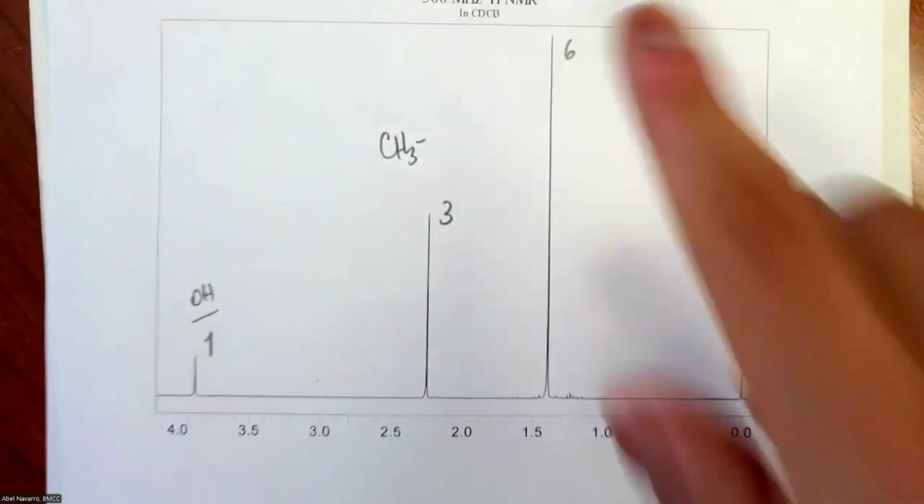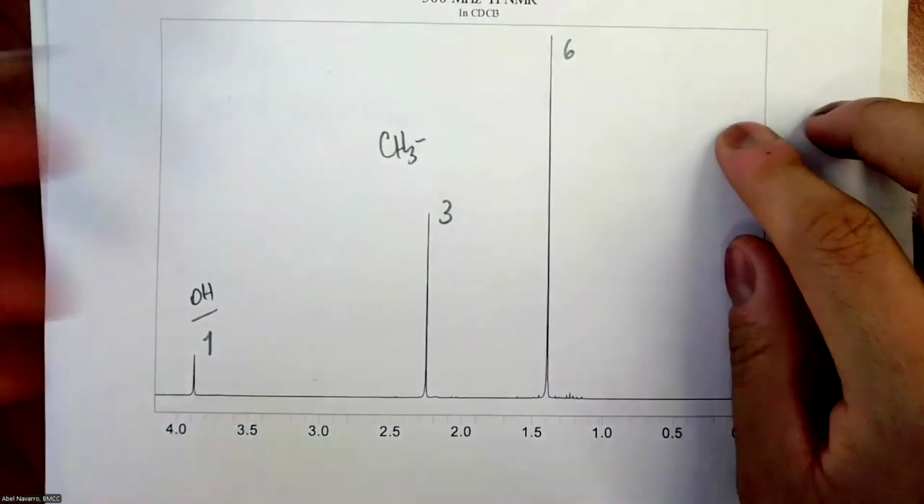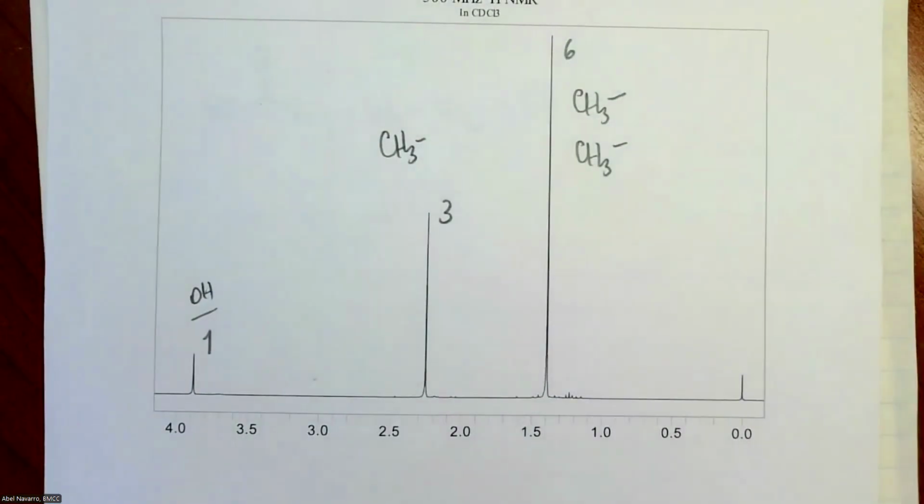And 6. What could be 6? Okay, so of course it's not a CH6. So what could that be? Okay, that one should be 2 CH3s symmetrical. Two CH3s, right, that are singlet and that are symmetrical, meaning that they are twins, right? They're attached to the same group. Okay, so what would that be?